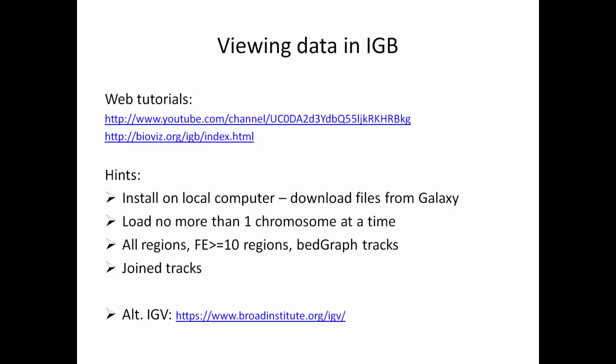I've mentioned several times about viewing and using the data from MACS2, but just to summarise, the spreadsheet output is the most important of MACS2 as it allows you to filter the binding regions, create different genomic ranges for downstream analysis, and annotate with additional information. I always add the two closest genes to each binding region using a tool we developed called RNA ChIP Integrator, which I will describe in a future video.